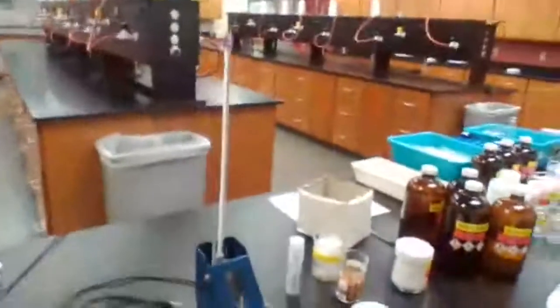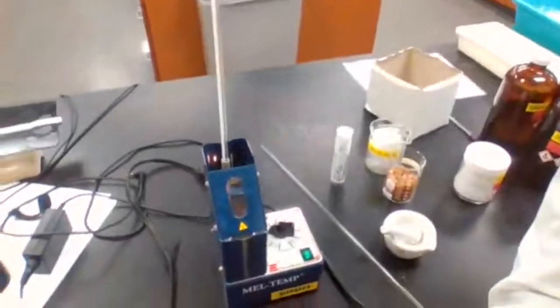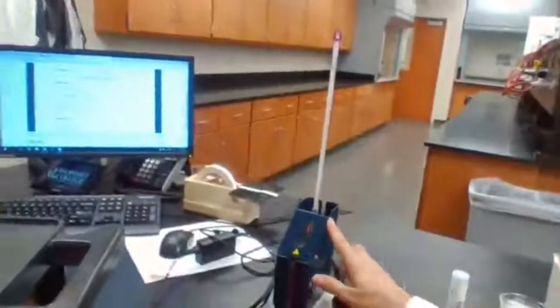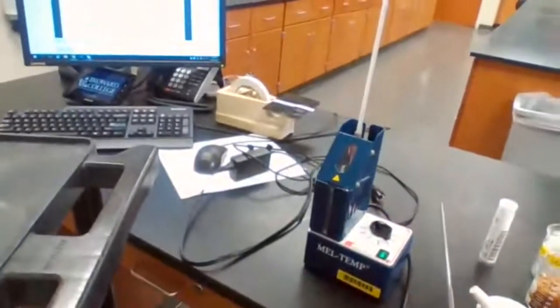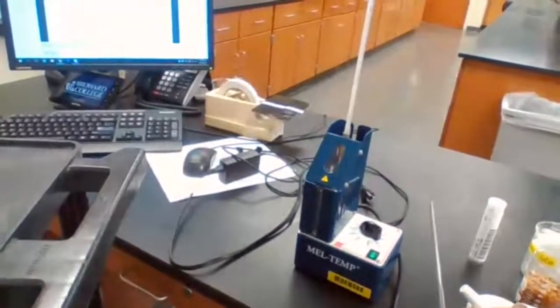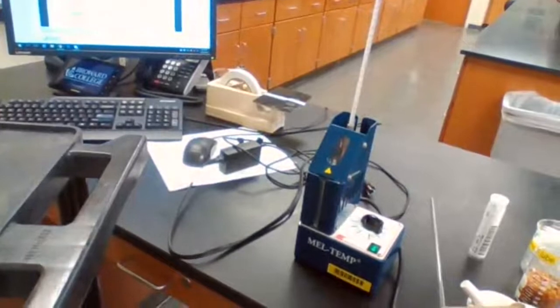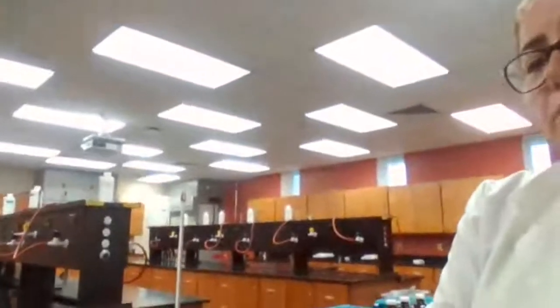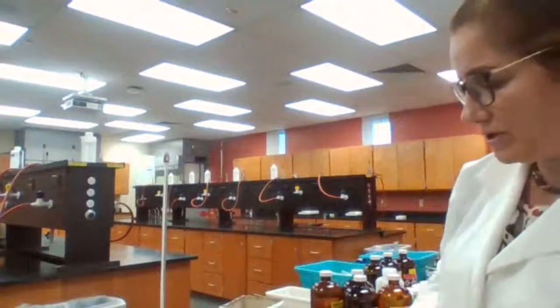Okay. If you could take a screenshot of the setup now for the melting apparatus. Take the screenshot. Hold it. This is the apparatus. You could see, right? It's visible. A screenshot of the apparatus at this point. And you would use the screenshot to submit it to the same assignment folder for the data sheet.